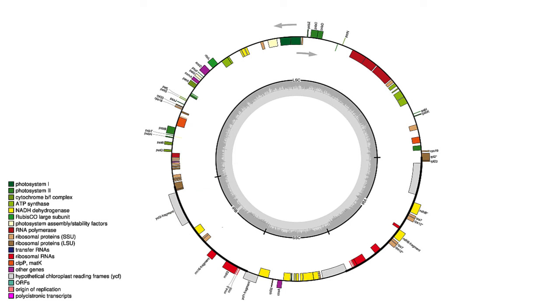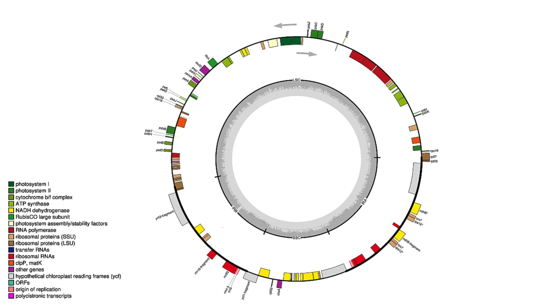Separating them is a small single copy region, SSC. The arrows show the start and end of the sequence assembly.